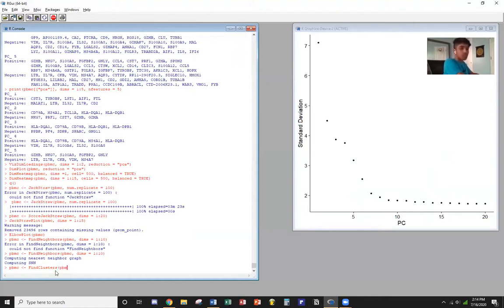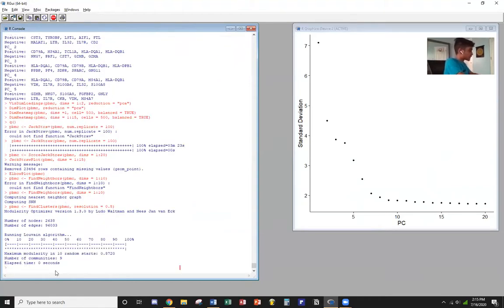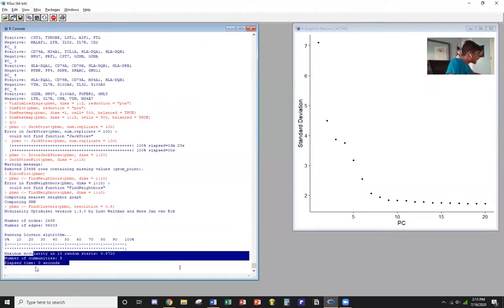If you're interested in learning about the other functions or learning more about this, Satija Lab actually has their own set of tutorials, but you have to be careful to make sure you're looking at the most up-to-date tutorials. Like you'll search up, say, FindClusters function on Google, and it'll show you information about that function, explain what it's doing, and give example code. The only downside is that it's not a video; it's just a guide. As you can see, it tells the number of nodes and number of edges, so it ran an algorithm here and gave us this information.